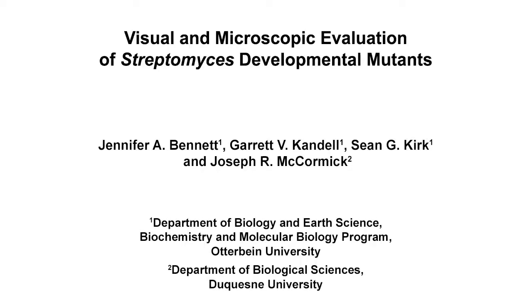The overall goal of the following techniques is to train beginning researchers to work with Streptomyces and other related species in the university teaching laboratory and high school classroom settings.